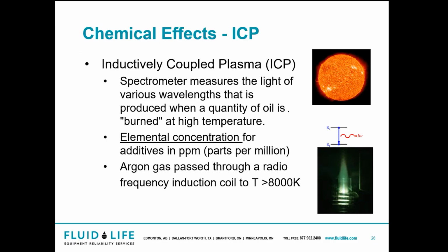ICP, every single sample, grease, oil, anything, we're going to do an ICP test on it. So this is that basic sample. What happens with this one is when you look at your oil analysis report and you have that green bar at the top with all those elements, that's what this test is measuring. Now, the limitation is it only goes up to 5 microns in size.